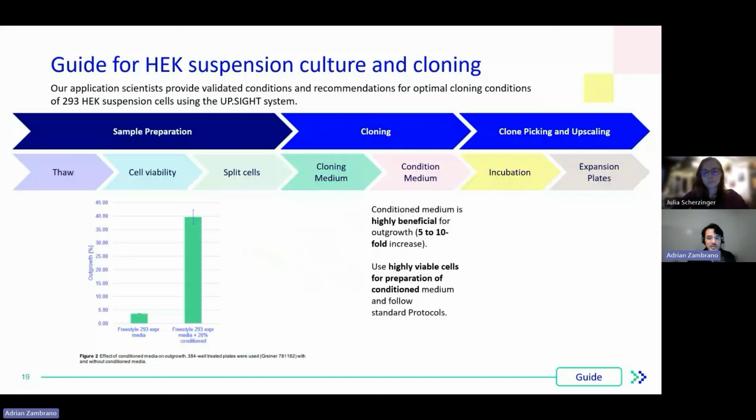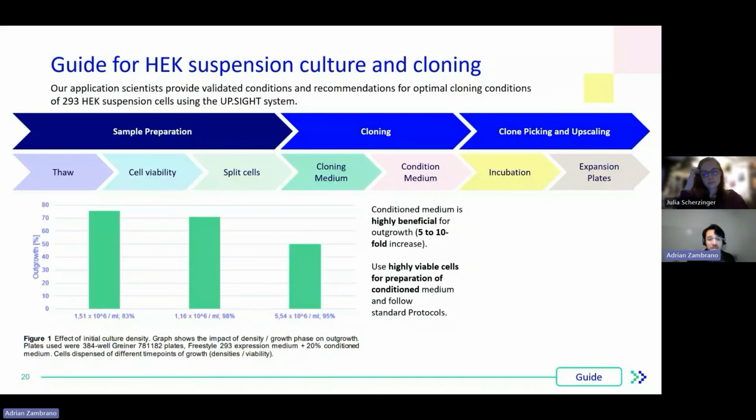To say yes. Second part, we also look into how to prepare this cloning media, right? Because I didn't show you how this was also optimized, another process. I know it's not always possible to have conditioned media, but definitely if you have the chance, this would be a way. We looked into what would be the best cell density conditions, and then we found an optimal condition around 1.5 million cells as the best seeding condition for this protocol.